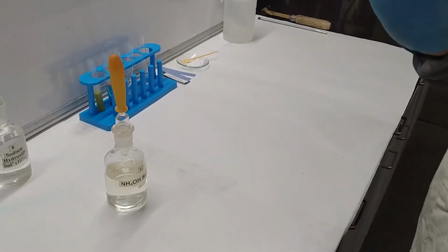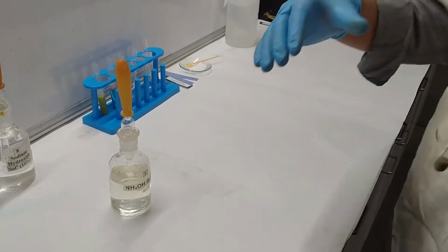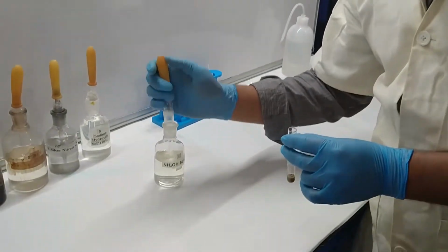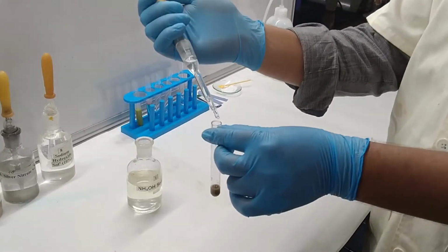Okay, so by this way you can add, so I add some drops first of all.